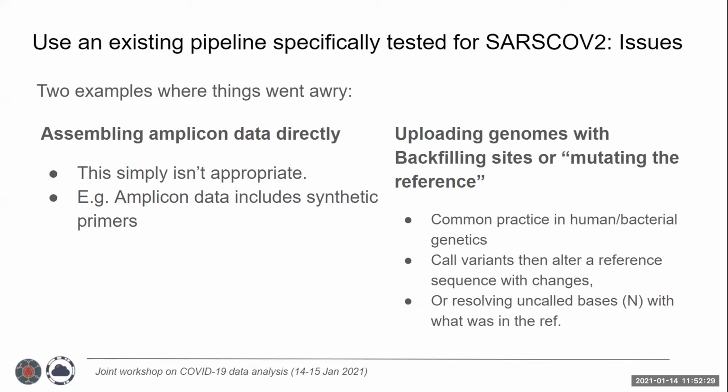And in all three of these cases, if you do this, do not upload this to public databases as if this was a complete run-of-the-mill SARS-CoV-2 genome. This is simply not what people are expecting. This is not common practice. Do not do anything like this.